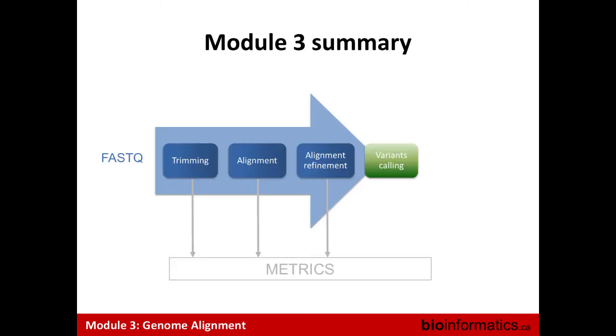Sorry, maybe I missed it. Could you please repeat what the mate position is? The mate position. Yeah. When you do your sequencing, you've got your fragment like that. You've got your read one, read two. So if you are looking at the information for read one, the mate position is the information of read two. So this is just a number to address the position of the other read.